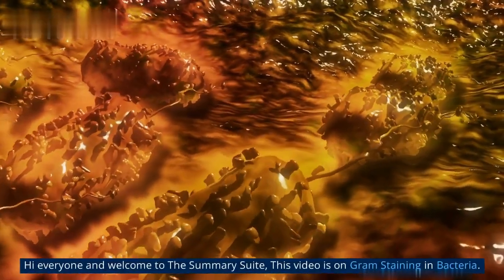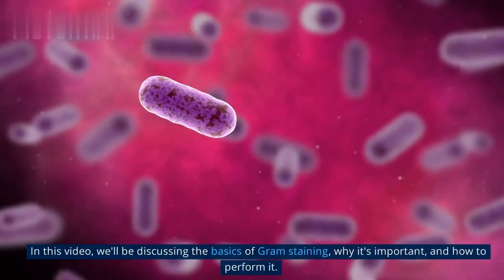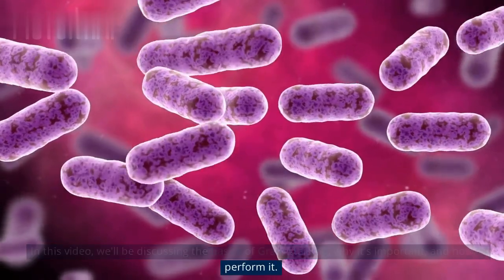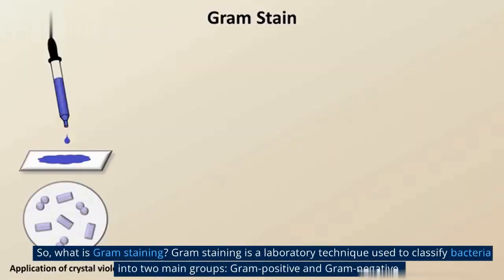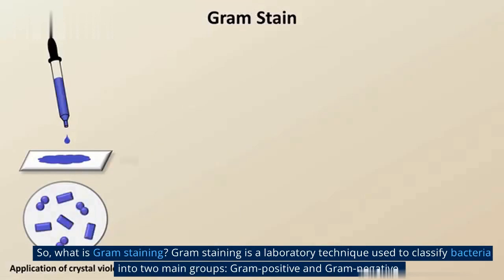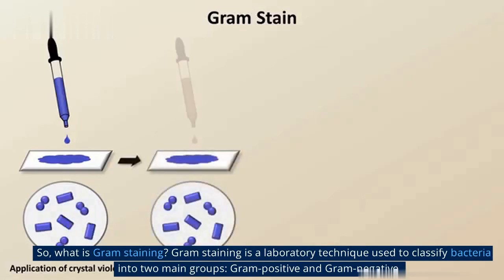This video is on gram staining in bacteria. In this video, we'll be discussing the basics of gram staining, why it's important, and how to perform it. So, what is gram staining? Gram staining is a laboratory technique used to classify bacteria into two main groups, gram-positive and gram-negative.